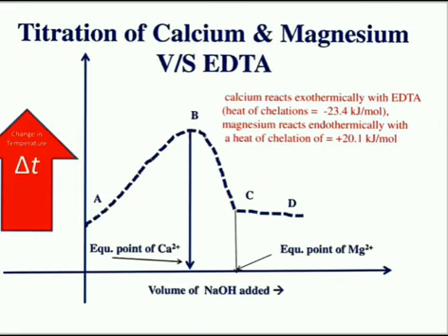Here the thermogram obtained for this titration is given in the figure. In this figure, the titration curve for this mixture is shown.